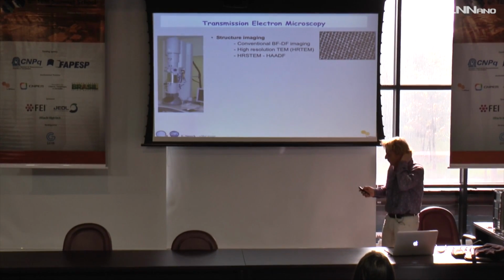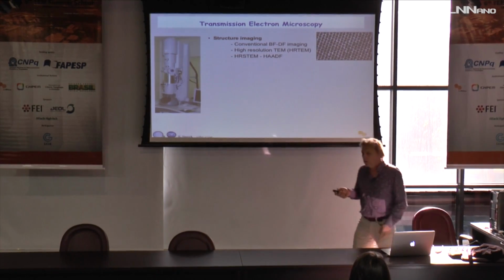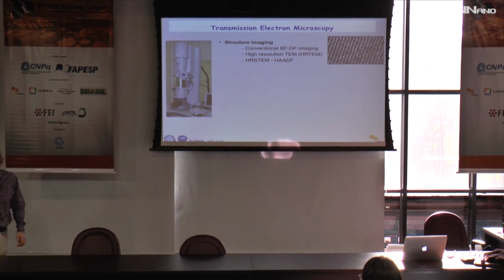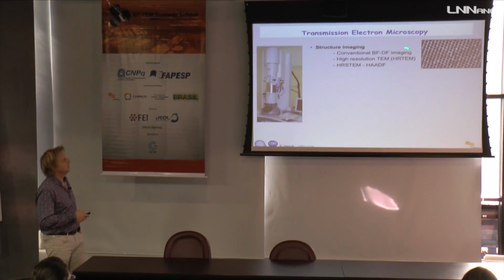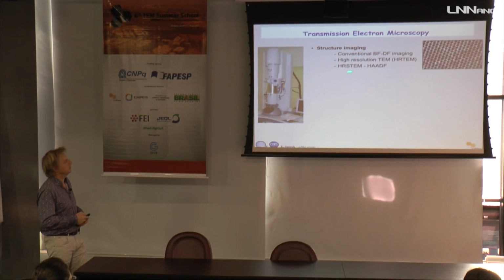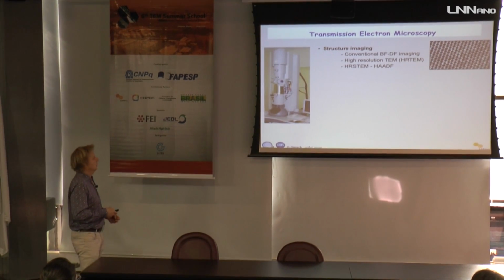But first, you probably know, after more than a week of TEM, that TEM is a very efficient tool for images. You can have nice and interesting TEM images in a conventional bright field or dark field imaging mode, or high resolution mode, or even high resolution STEM mode, but that you probably already heard, or you will.